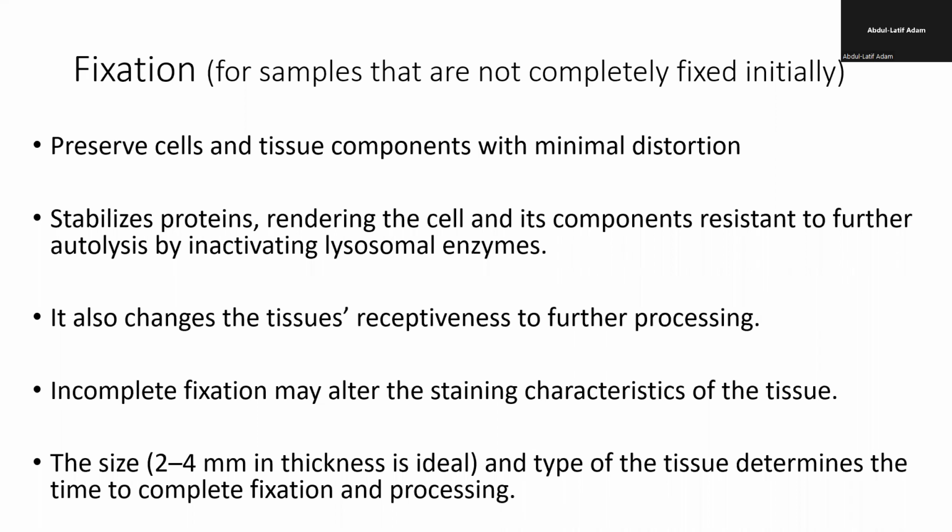So in that case, usually the tissue is sliced into thin sections. Okay, so you have about 2 to 4 millimeters in thickness. You don't cut it so big, so that it will allow penetration of the fixative into the tissue to enhance complete preservation of the tissue.